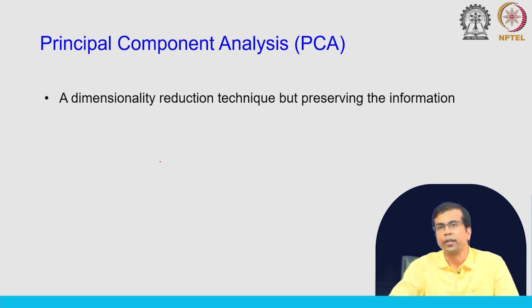When I say dimensionality reduction, in our normalized count data we have counts for maybe 7,000, 10,000 or 20,000 genes, and working with that many dimensions is very difficult. Maybe some dimensions are not so important, whereas some are important.